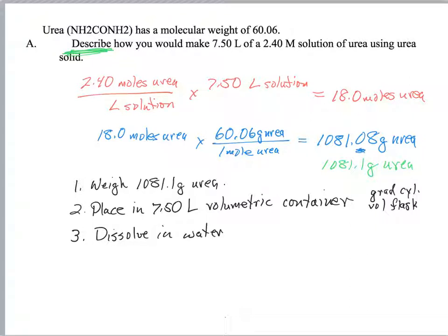We would dissolve it in water to some volume less than 7.5 liters. And then the last thing when you're making a solution of molar concentration, because remember, molarity is about how many liters of solution you have, it's the total final solution volume that's important.